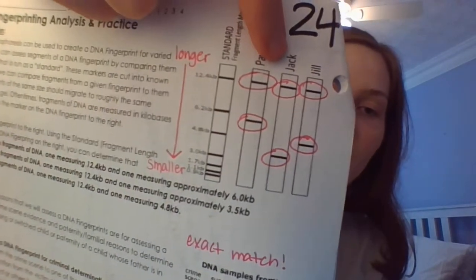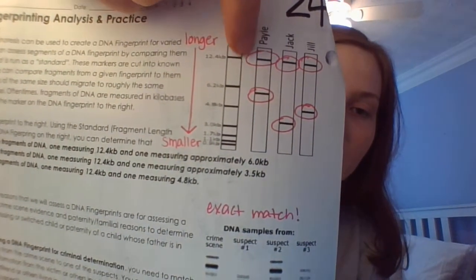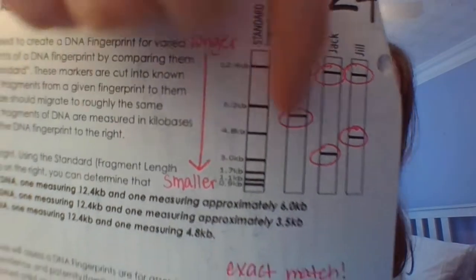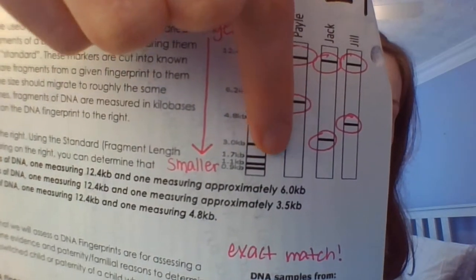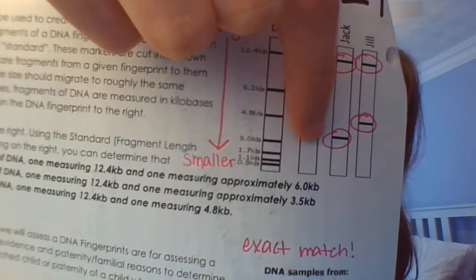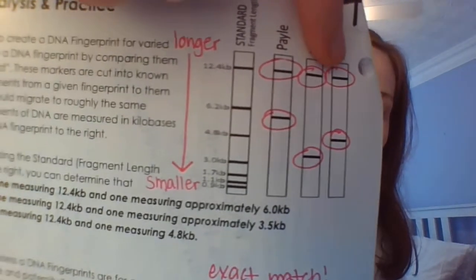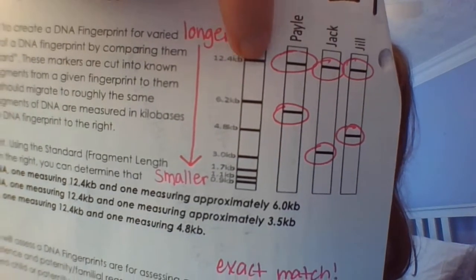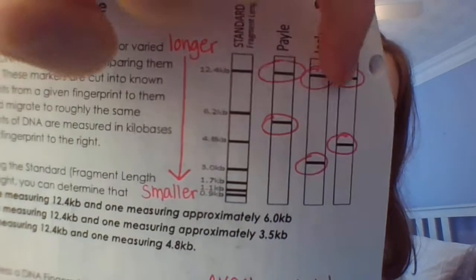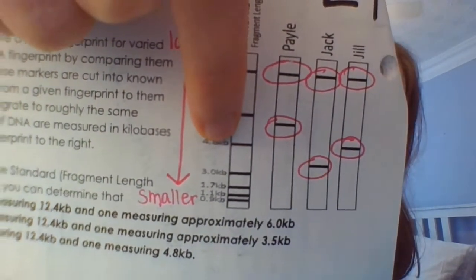If we look at Jack, he also has two bands. One band is at 12.4 kb. The second band would be around 3 kb. It's a little bit bigger than 3. So you could say like 3.1, 3.2. And then Jill has two bands as well. One is at 12.4 kb and the other one is at 4.8 kb.